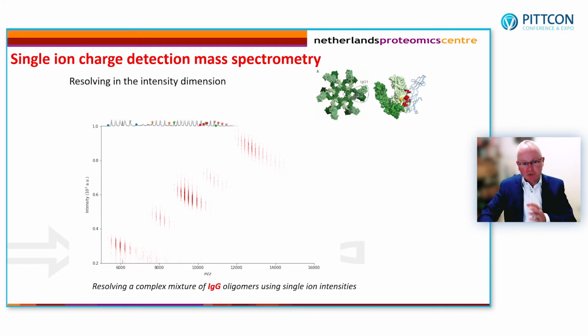And we can see that they are separated in m/z in the normal mass spectrum, but we can see that they are even more separated in the intensity domain, or in the charge domain.